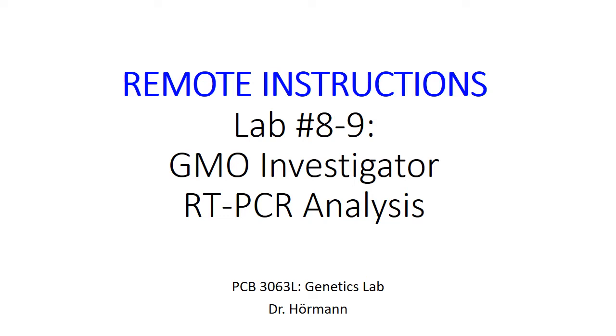Today we're going to be discussing RT-PCR and we're going to review electrophoresis, and along the way I'll also talk to you about exactly where you can go on D2L to find all your different resources as well as your assessments that you'll be working on for this week's lab.